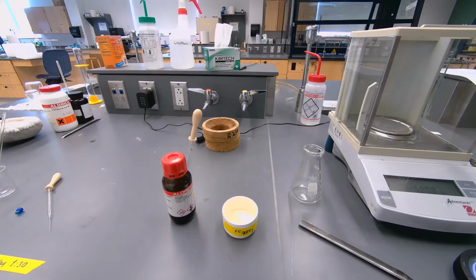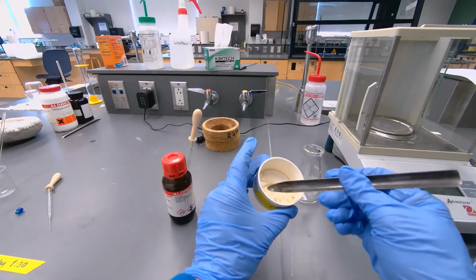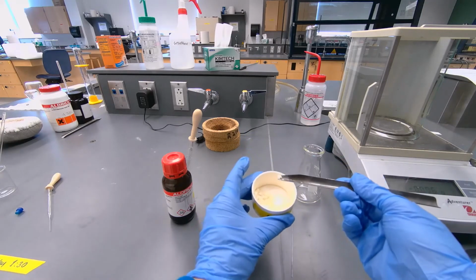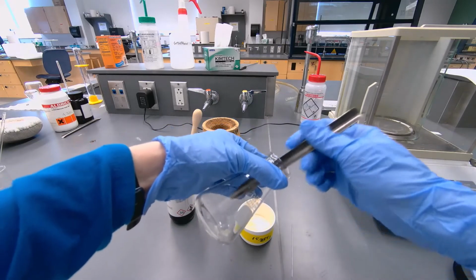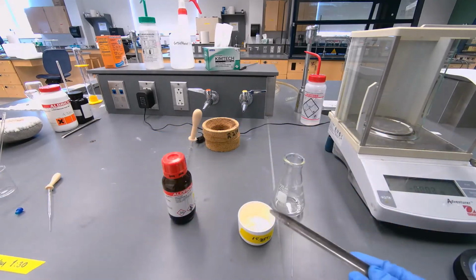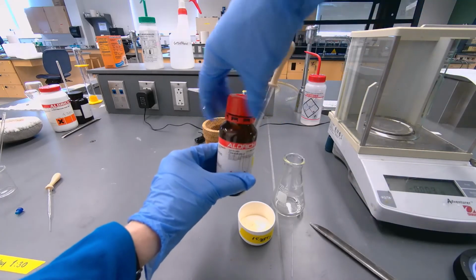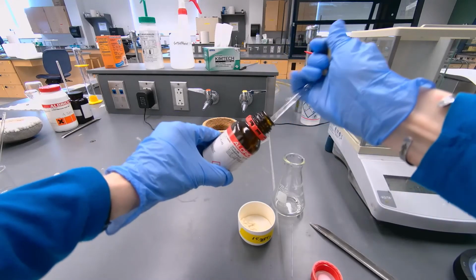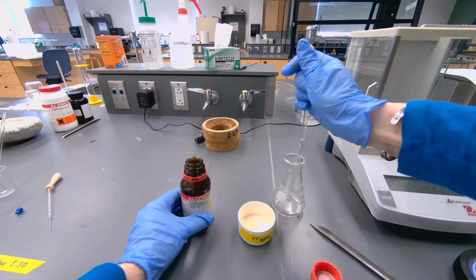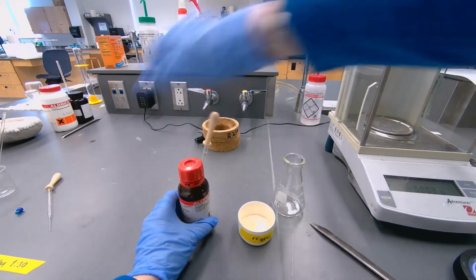So I'll show you how to make up the NMR sample from a solid. We can take our solid, just grab a little bit on the end of the spatula, and put it in a clean, dry vessel. It doesn't really matter what it is. Solids are helpful to do it like this. Then take the deuterated chloroform, a little less than a pipette full, and just add that right in. Swirl it to dissolve.